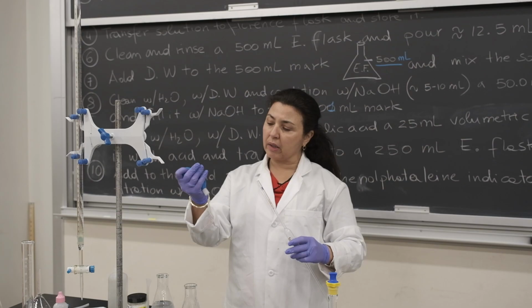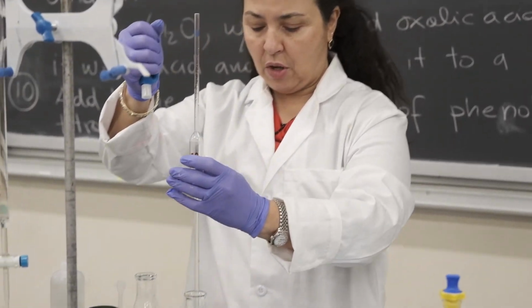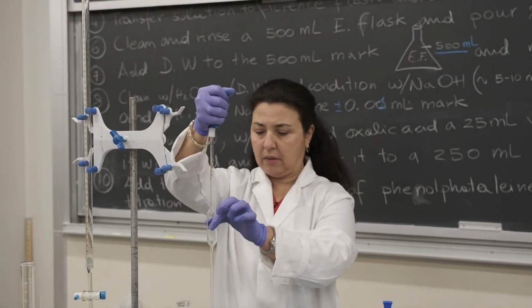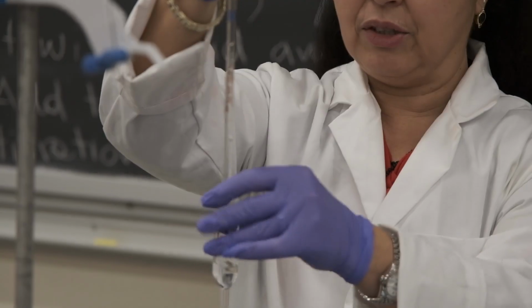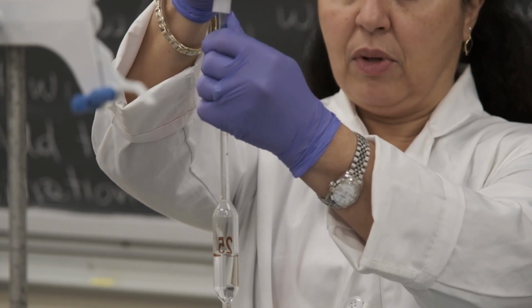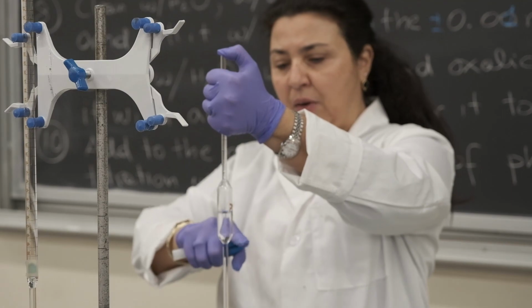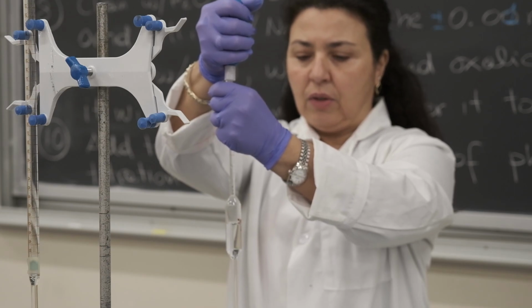So the way it works, the pipette is you squeeze very well the bulb, you put your pipette into the water solution, and you start to collect your 25 milliliters. You keep your hand very close to the tip of your 25 milliliters so that when all the air has gone inside the bulb, you can squeeze it again without losing the liquid and start again to collect your solution.